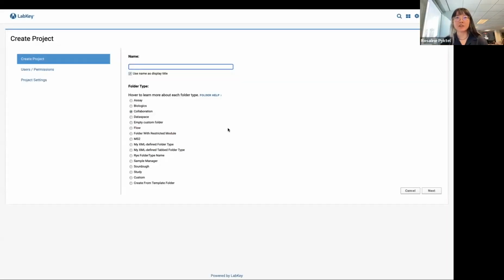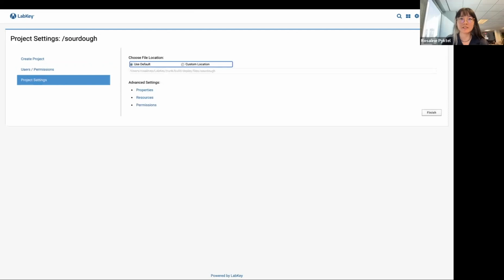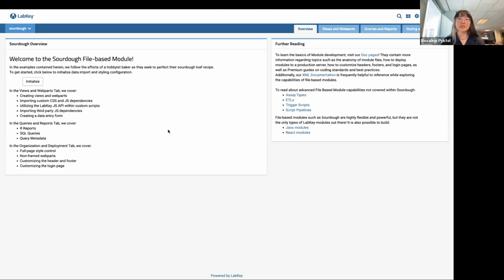All right, so here we have the page for creating a new project on my server. I'm going to, for reasons that will become clear later, name this sourdough. Select the sourdough folder type, accepting other defaults. Alrighty, so here we are on the landing page.